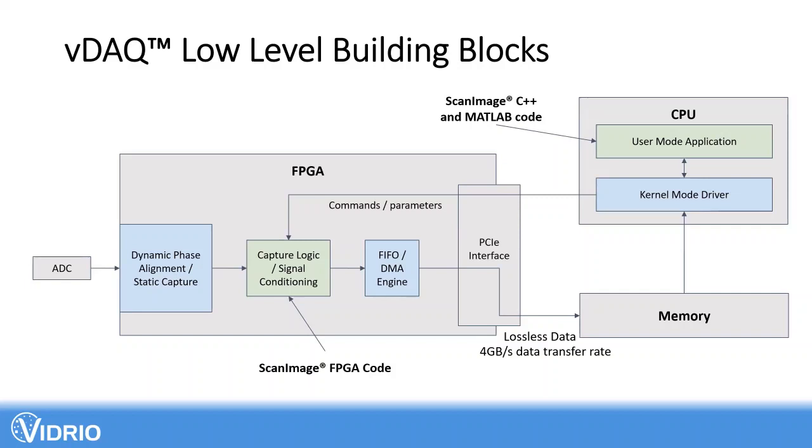Yeah, absolutely. Thanks. But this would be available through the MATLAB interface or through what exactly? It wouldn't be available through the MATLAB interface since the C++ backend of ScanImage intercepts the data first, just to make sure that the performance is adequate and all the data gets logged to disk.